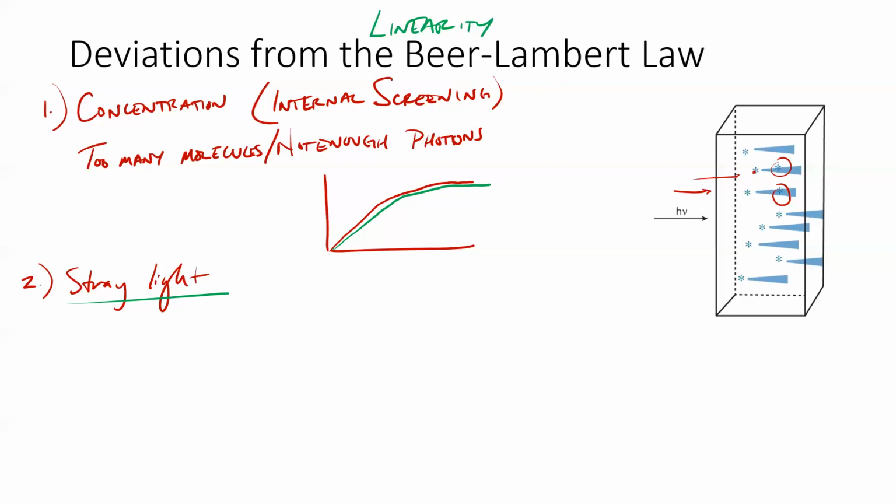The issue with stray light, usually more linear range, that's a good thing. Let all the stray light in, right? The issue with stray light is that it's not monochromatic, right? And so we're not getting whatever single color we're interested in getting, where we're doing ourselves a disservice.